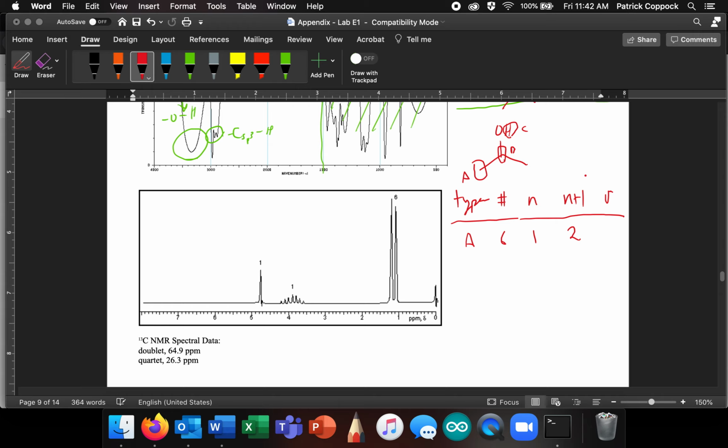So these are the closest thing to this, and this, you should have this on your paper, right? You're testing to see if you get the same thing I get. The closest thing to this is 0.9, right? Going a little fast. My marker's not working too well.